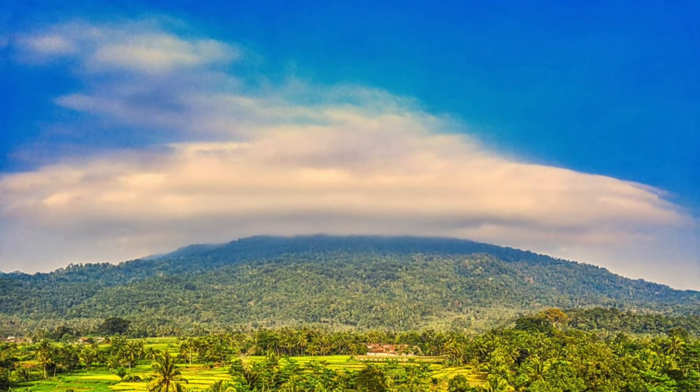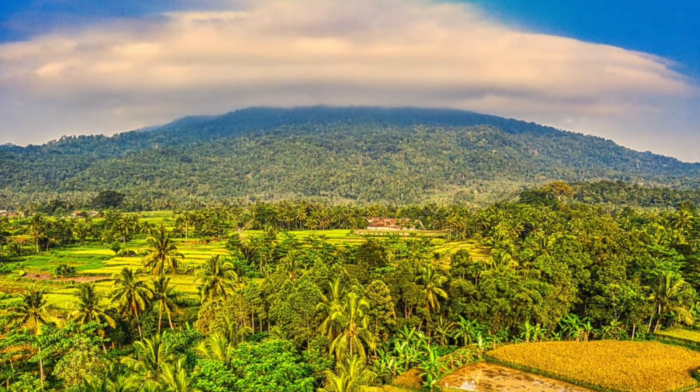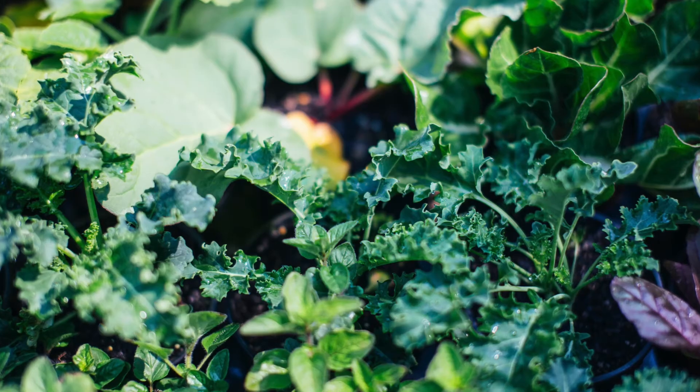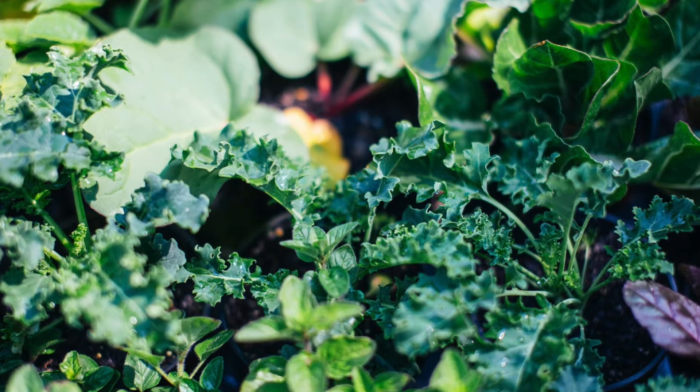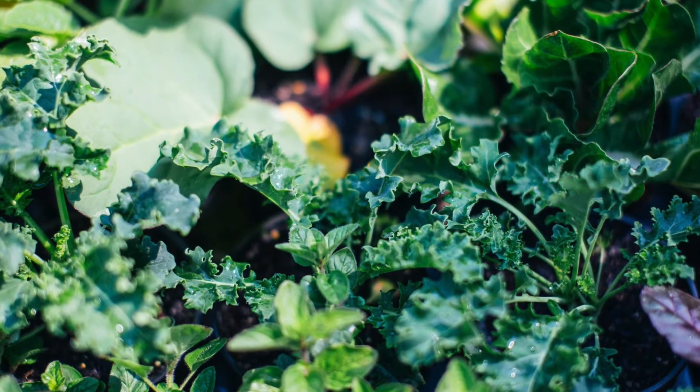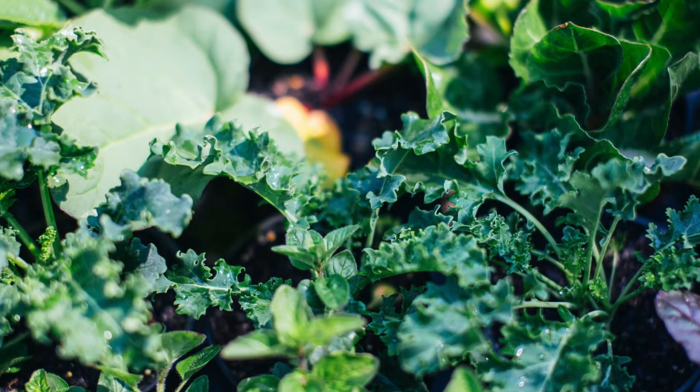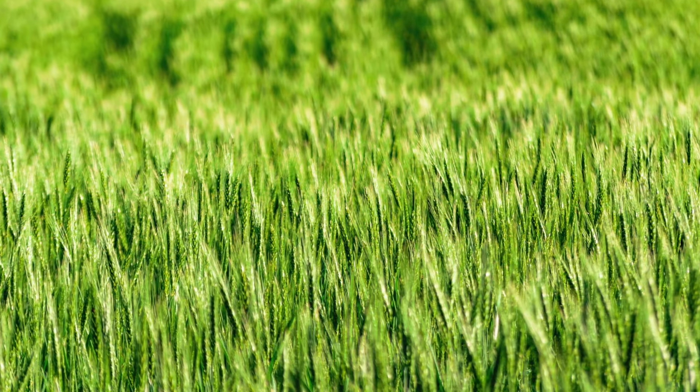First question comes in mind is why measure electrical conductivity of soil? The answer to that is, irrigated land accounts for 40% of our food supply and salts impact the yield on about one-fifth of those acres.